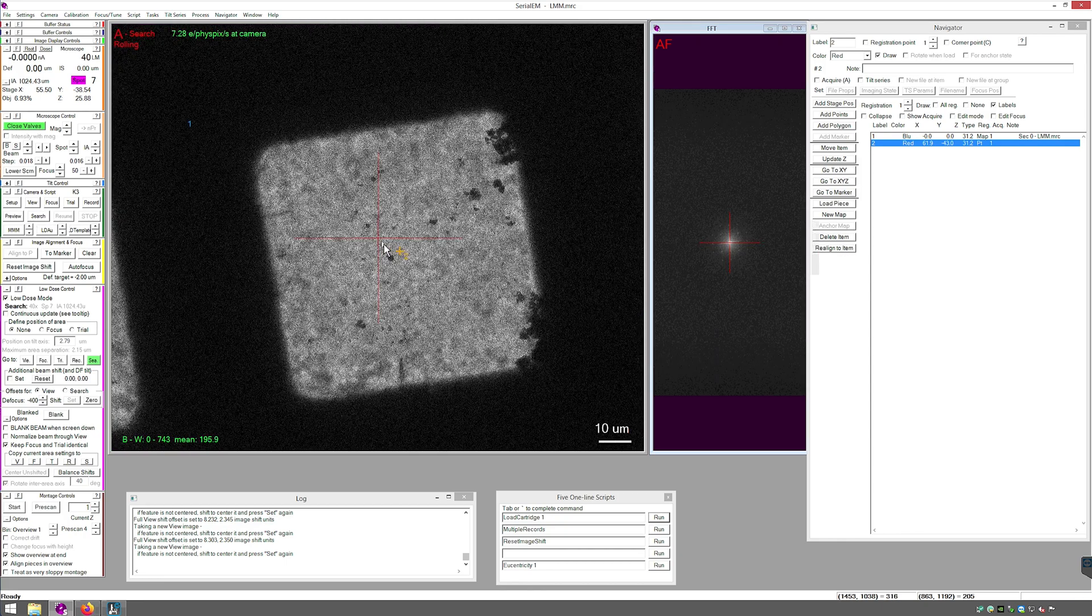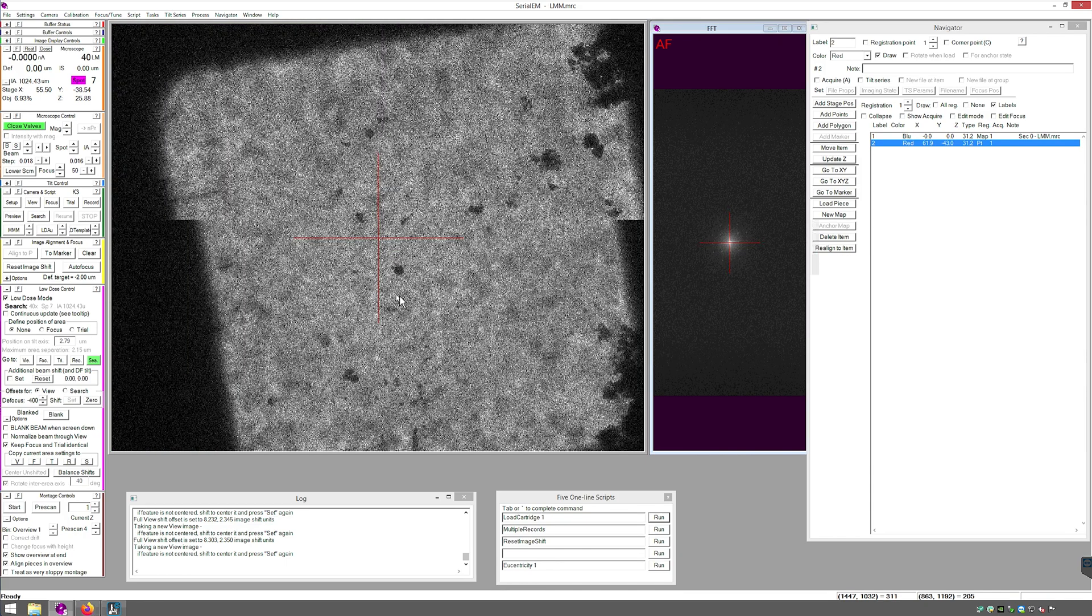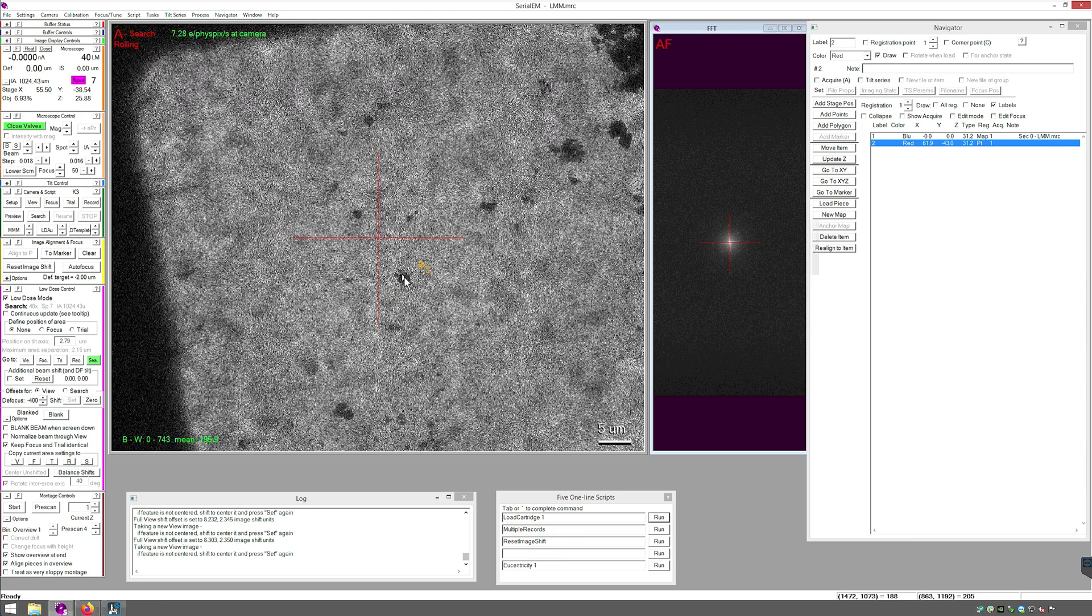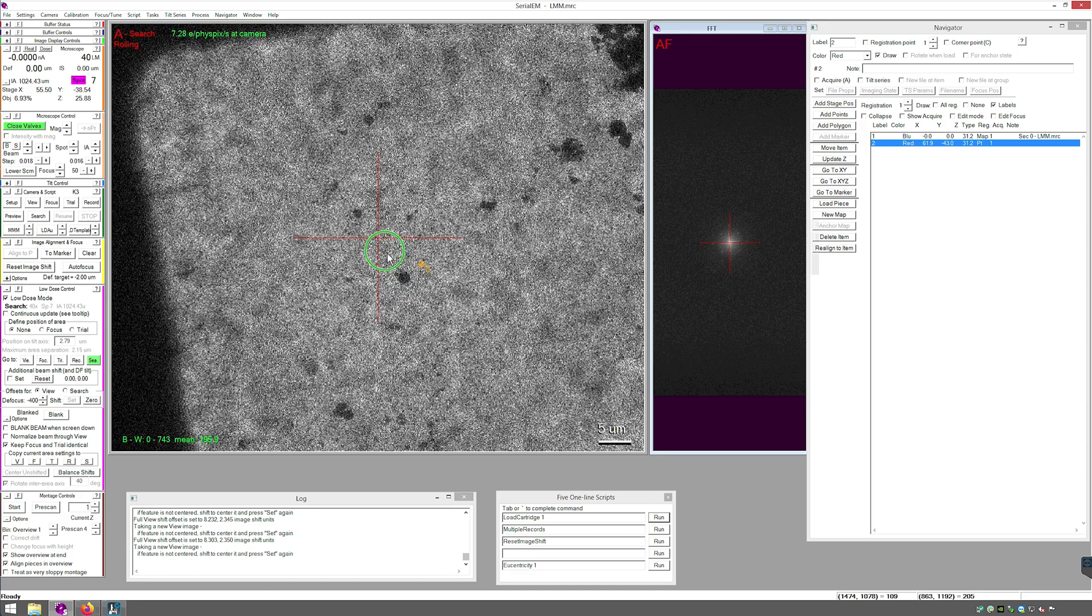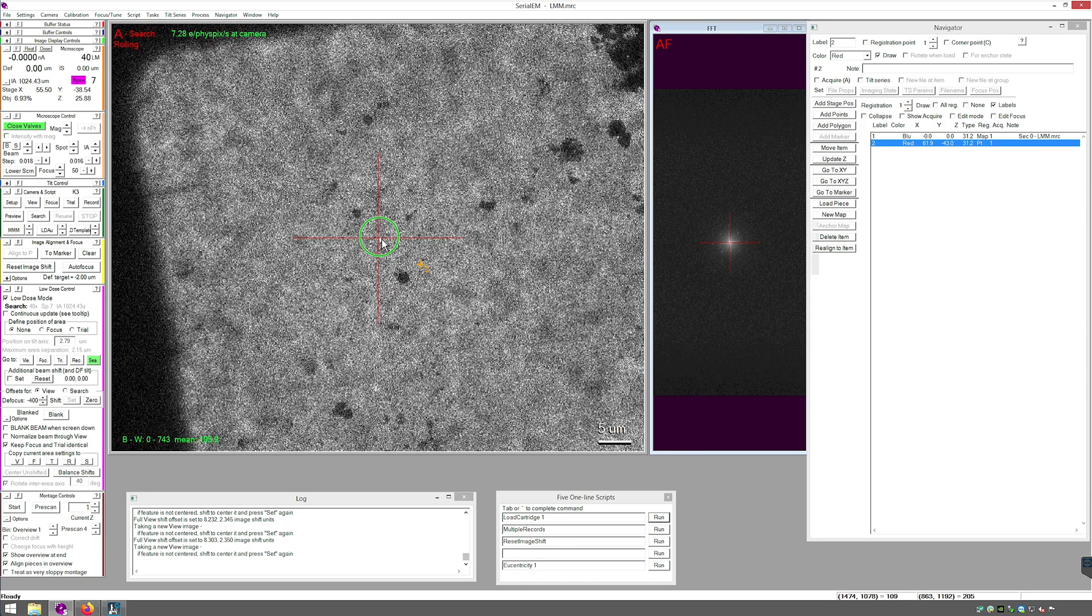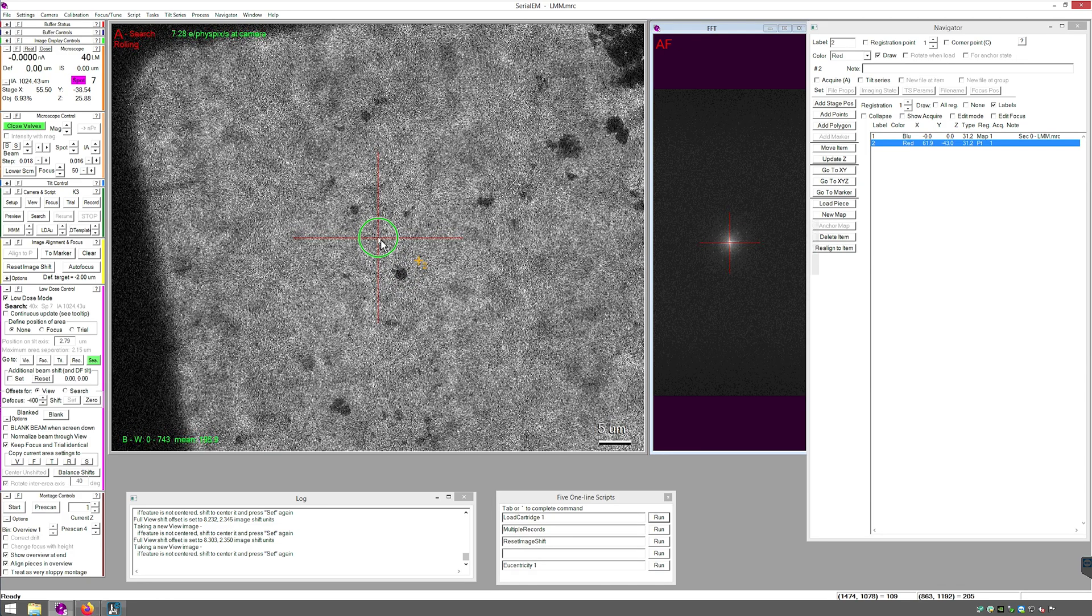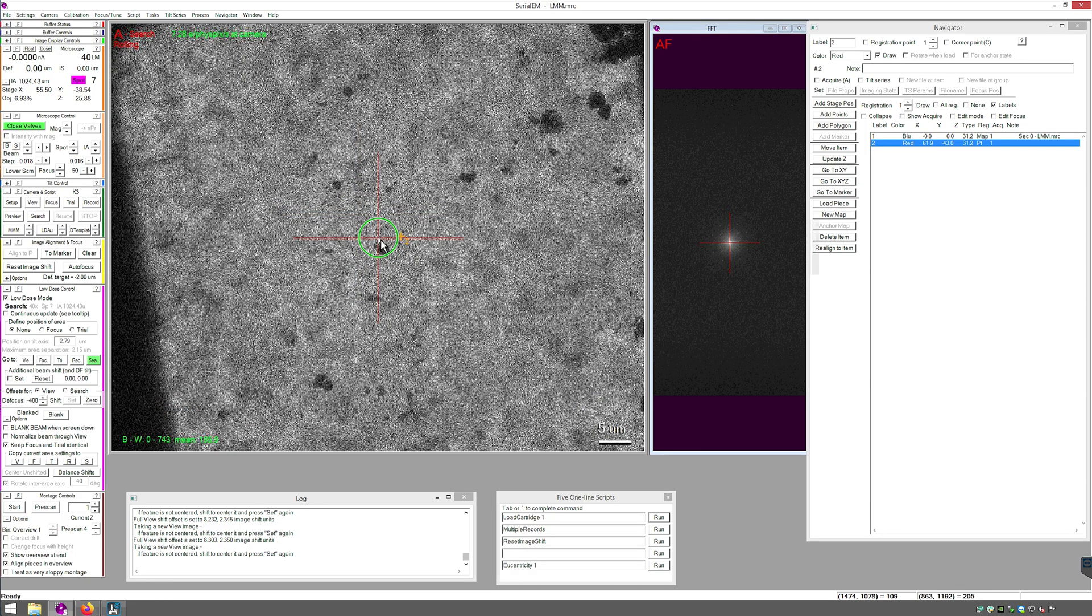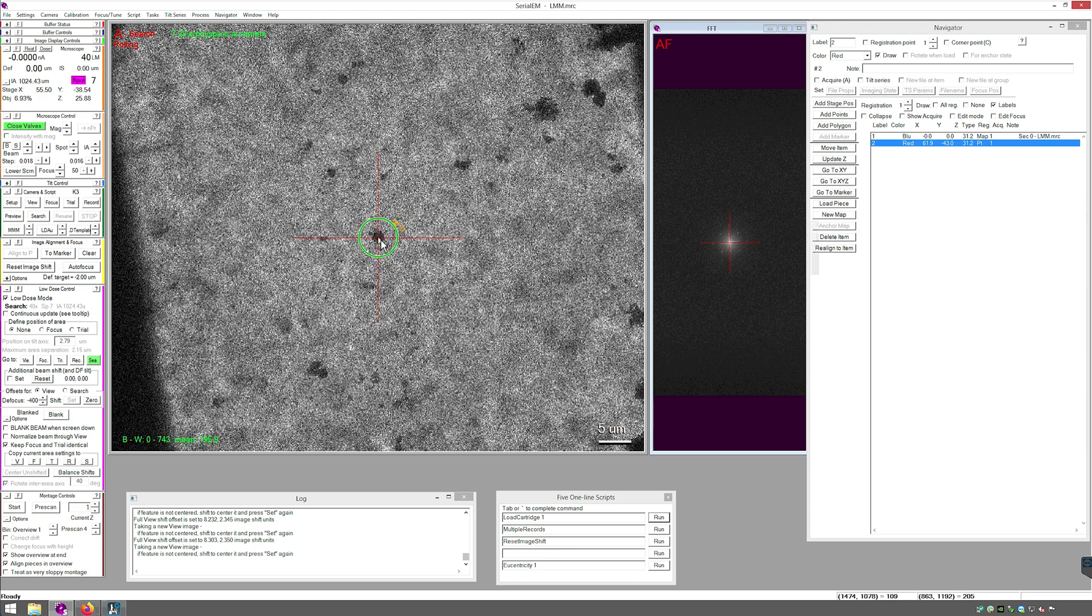And zoom in to find that feature. It's this one here. Right click so that it's an image shift. Drag to the center crosshair. Release. 7.53 micron offset.